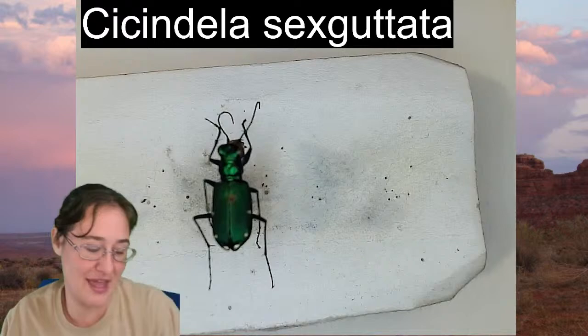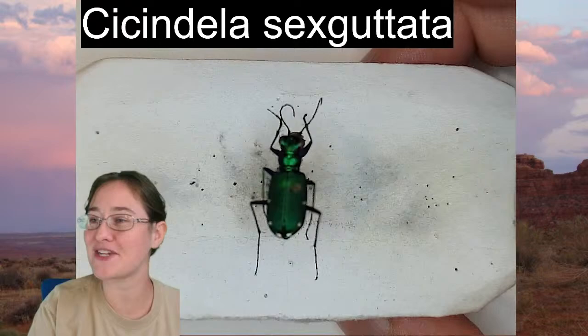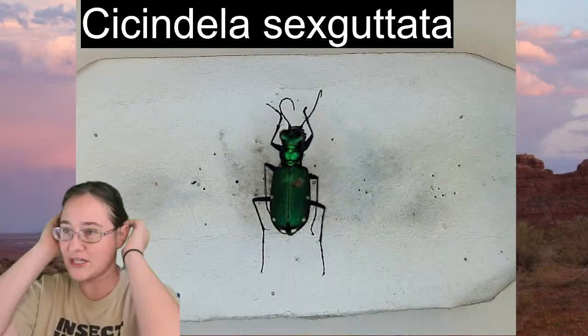Oh, and if you want, make sure you get a screenshot of the overall body shape, because the microscope does not have the ability to see the entire body at the same time. All right.